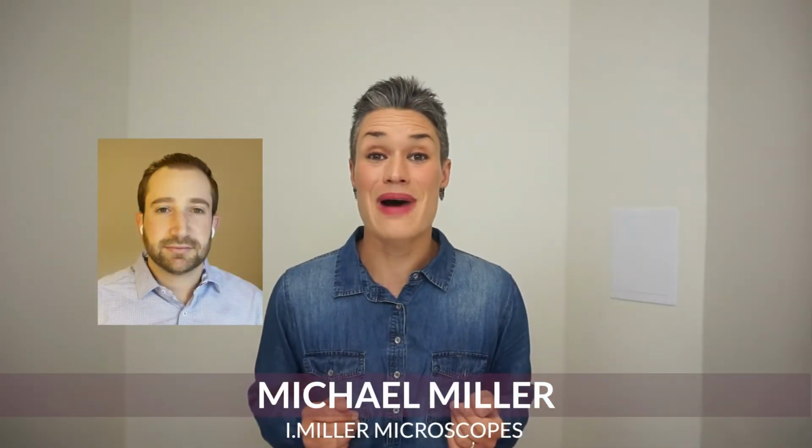So I invited Mike Miller from I.Miller Microscopes to show us exactly where to click and how to measure, including calibration of your objectives.